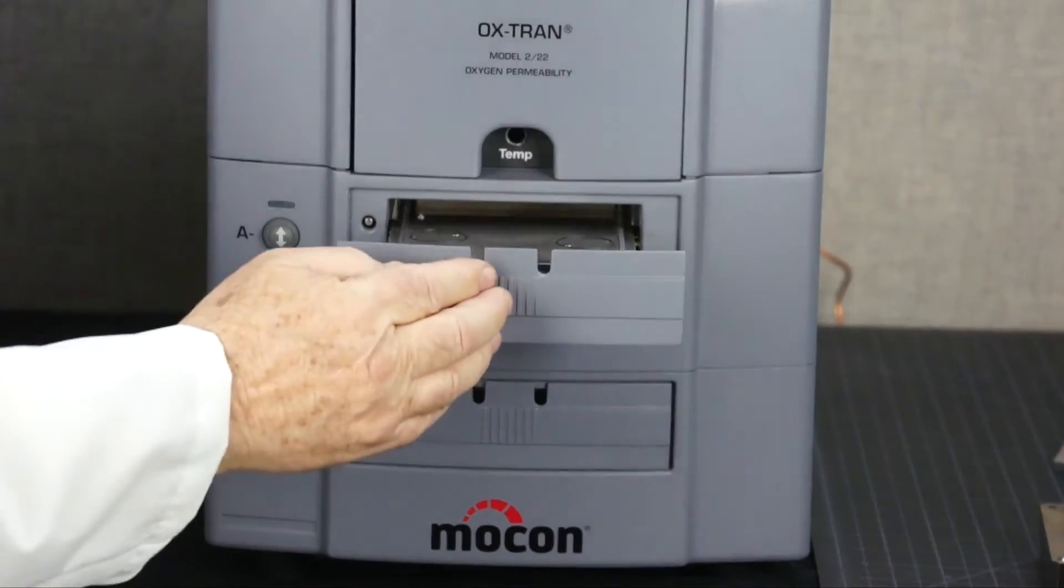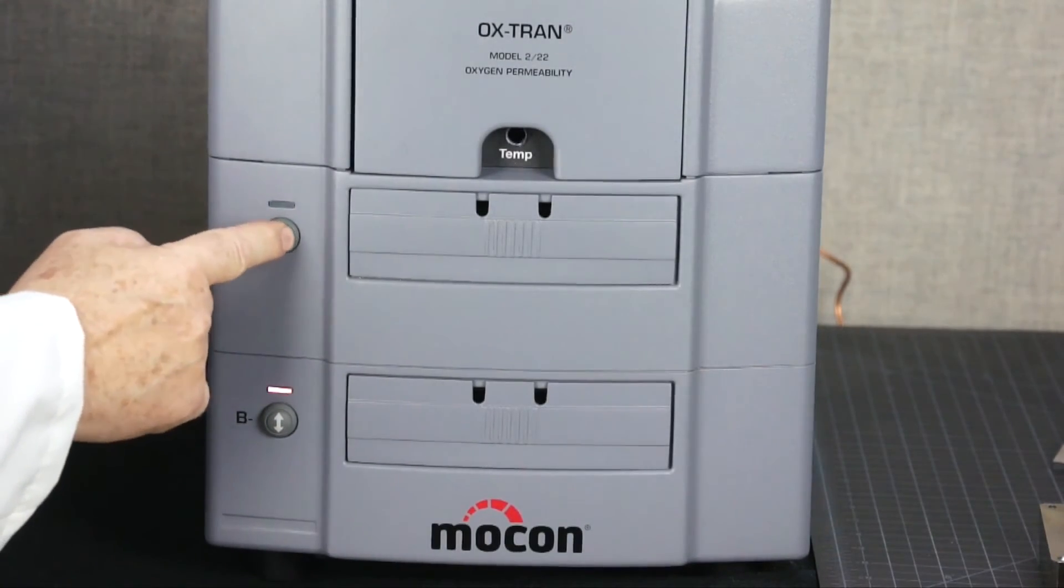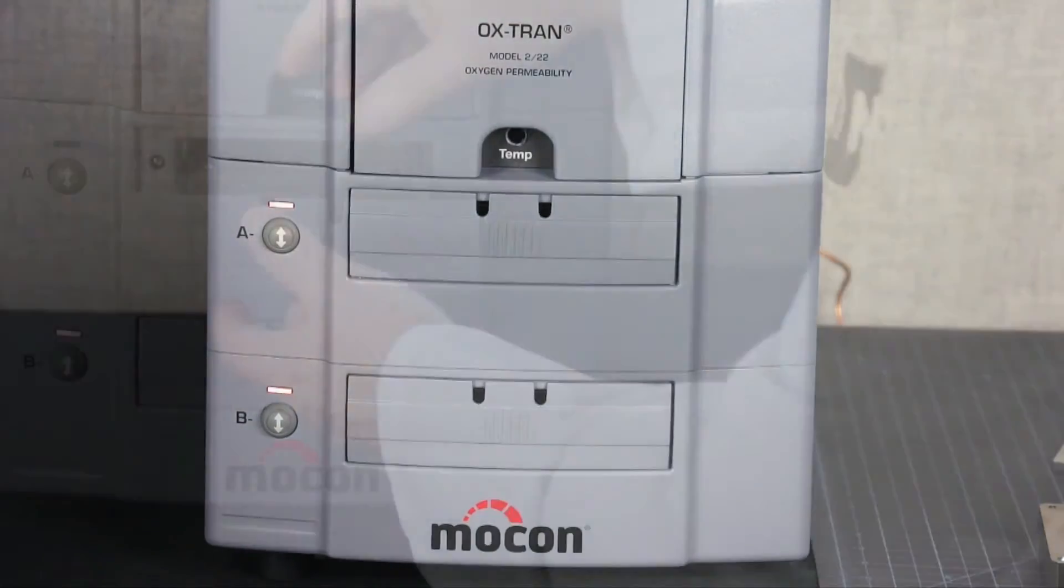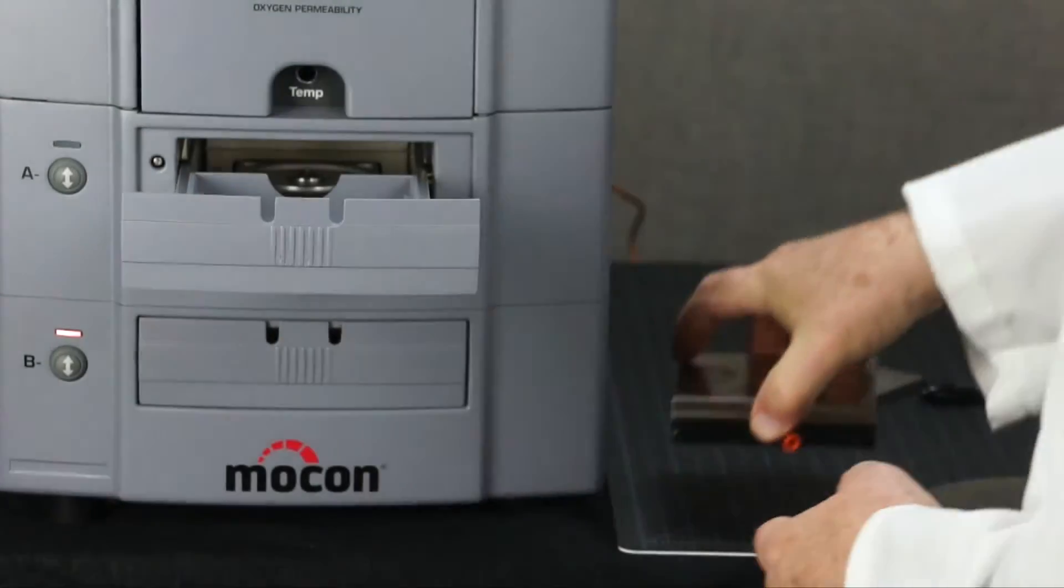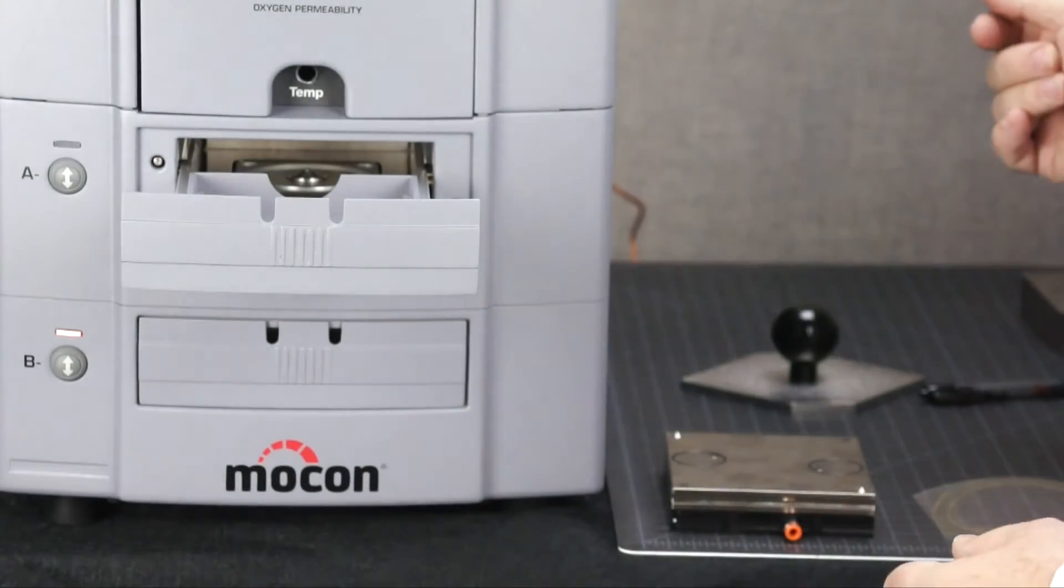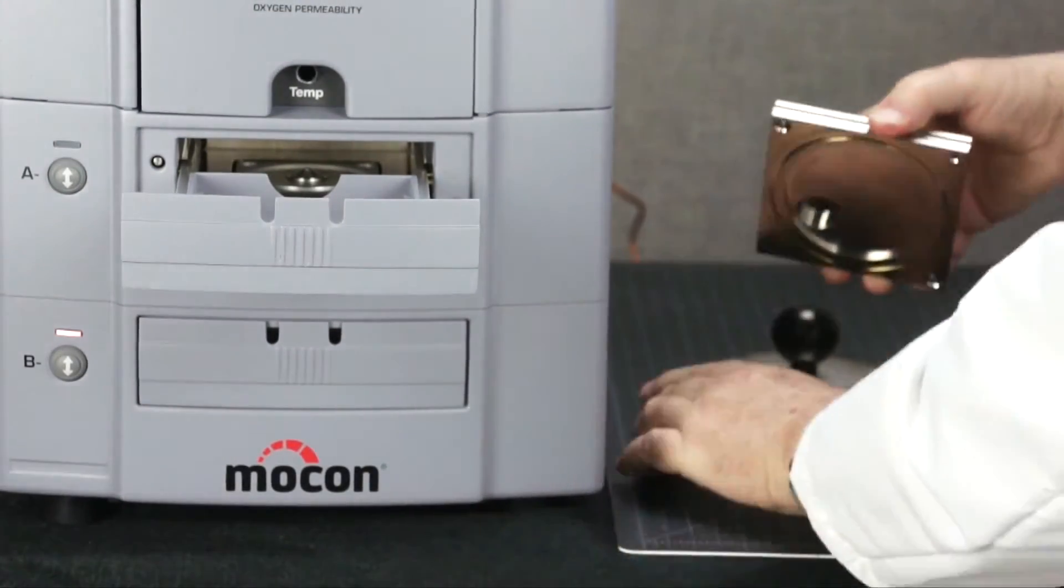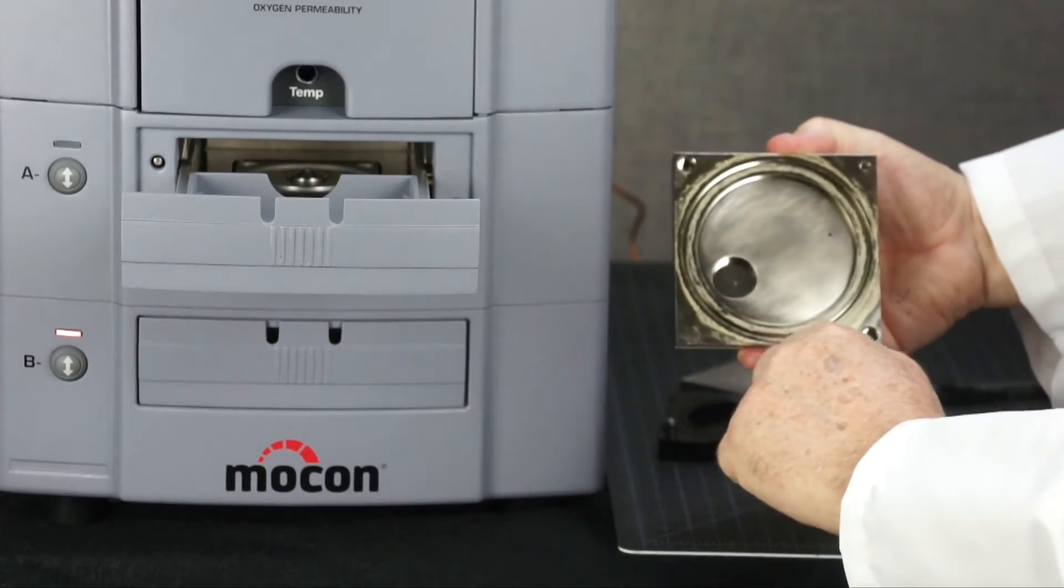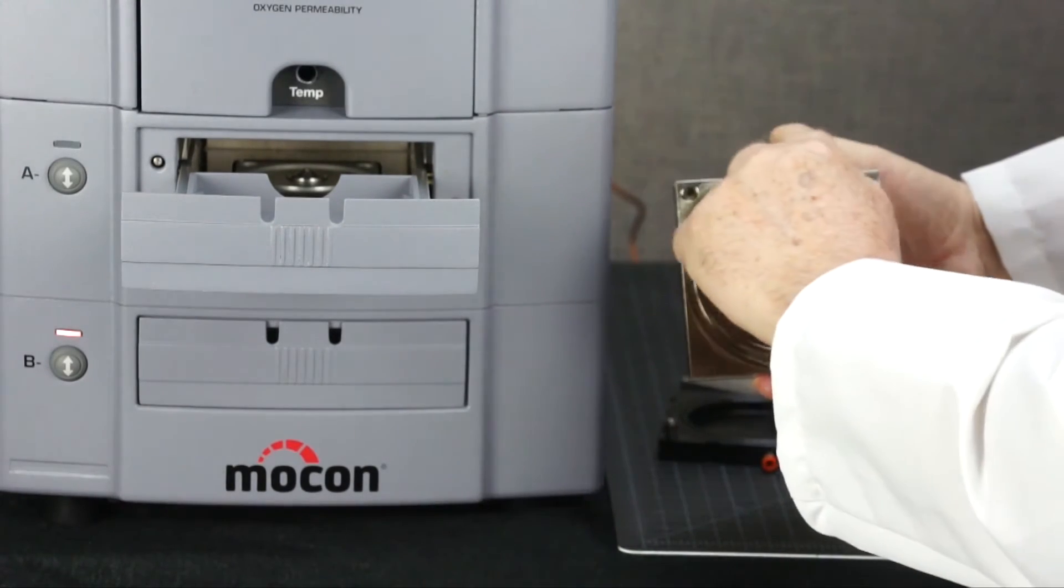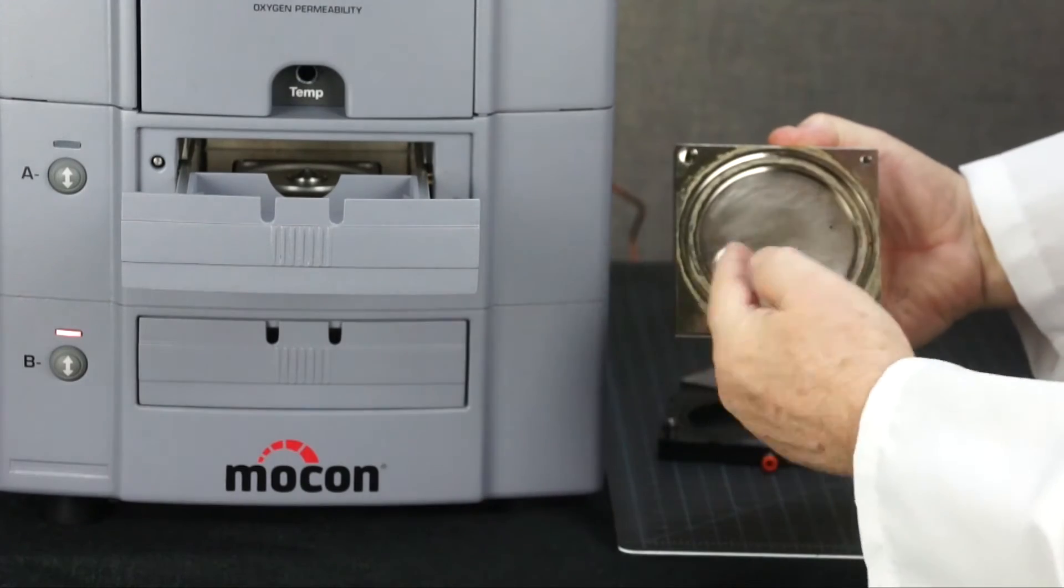We have added a Cell Clamped indicator so you'll know the cell is properly closed. To load a sample, remove the cell and place it on the bench. Open the cell and apply grease to the silver-colored top section, making sure no grease enters the flow ring groove.